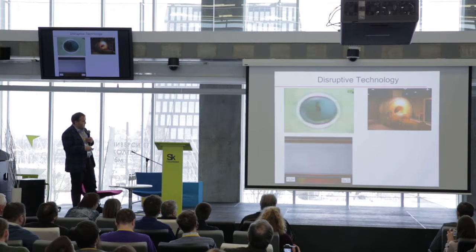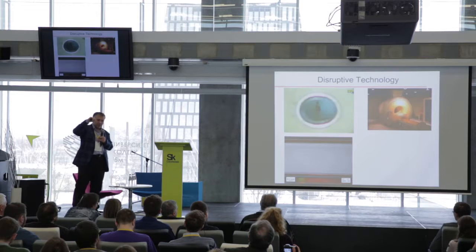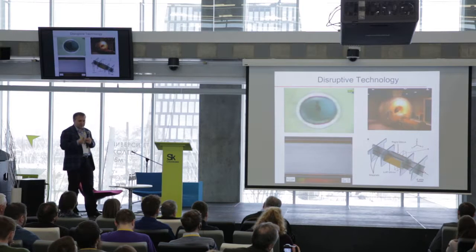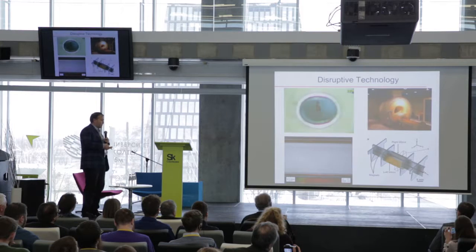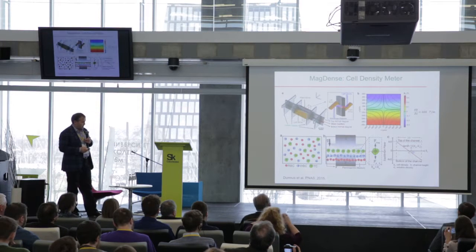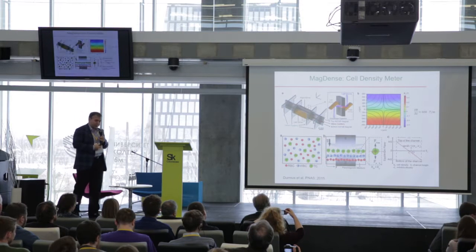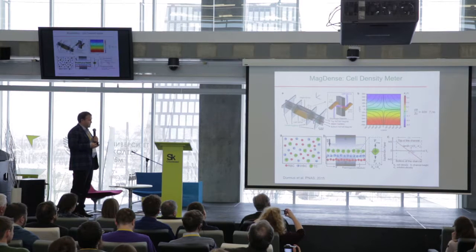So we still create a similar, very strong gradient, not by loading the cells with magnetic particles, but by making the environment around them paramagnetic. And that allows you to make a system that can cost $1 and can levitate single cells. And why is this important? I'll get into some of its applications and also show you what we are doing with it for spheroid creation or microgel assembly at the end.